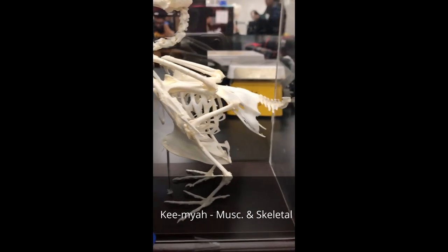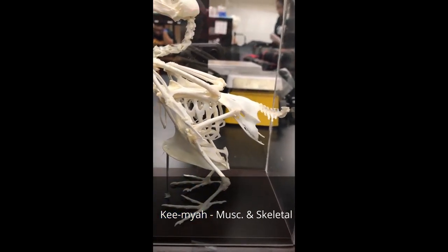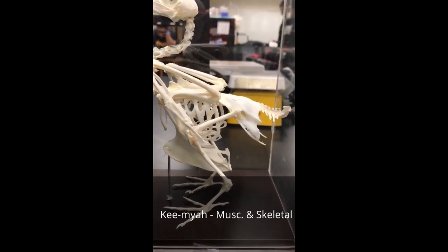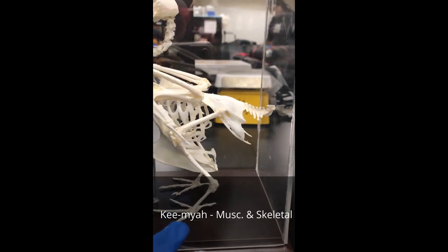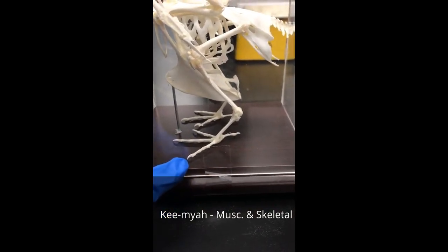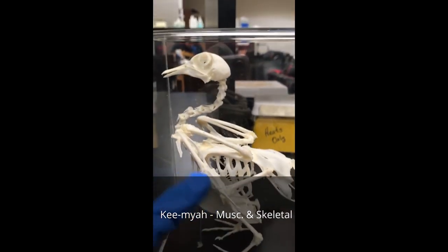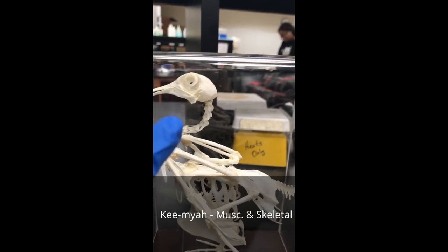And towards the foot, we have the ankle joints, the tarsus, phalanges, and you can see the claw here, which is used to grab things. It has a particularly small beak. It's not a large bird.